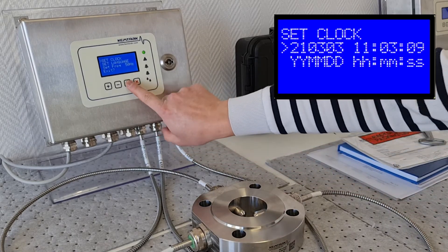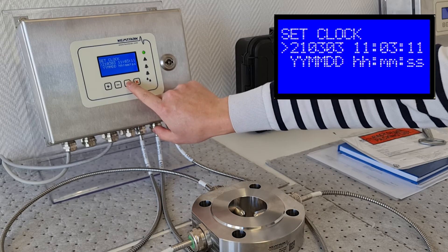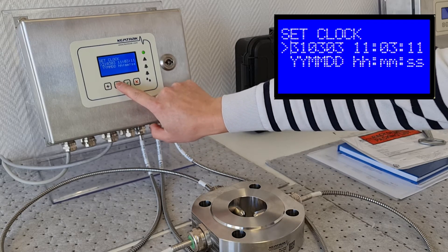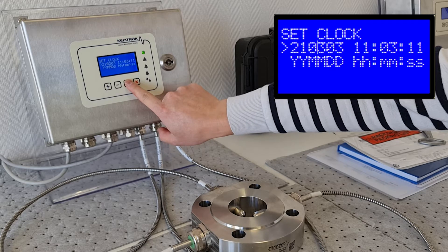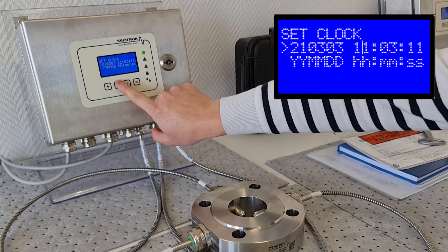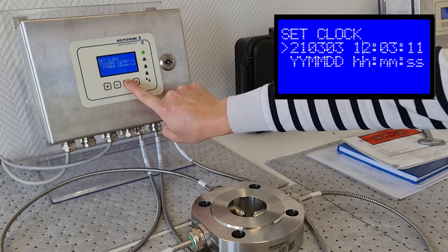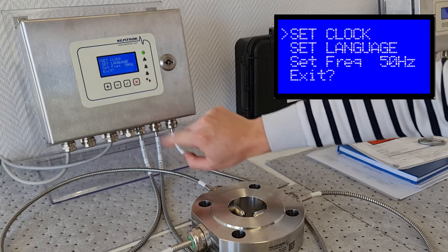Start by entering the date and time. Use the plus and minus keys to adjust the values. Tick to go to the next value. Then press tick for two seconds to confirm and return.